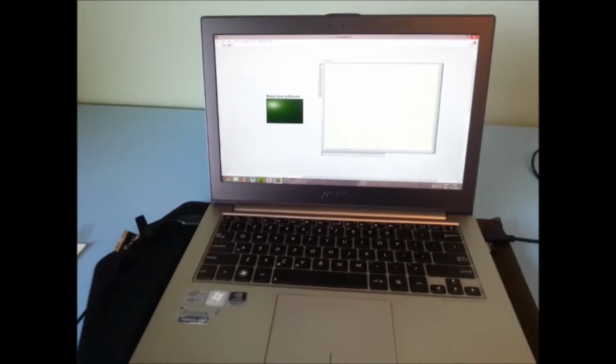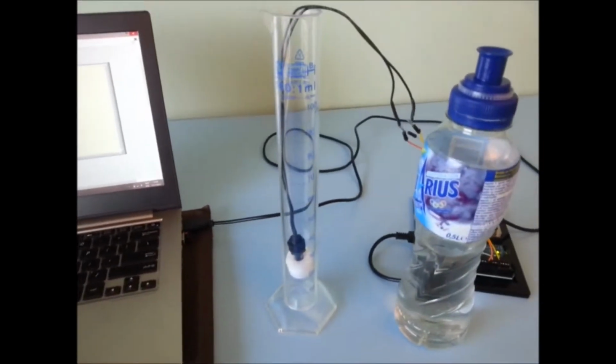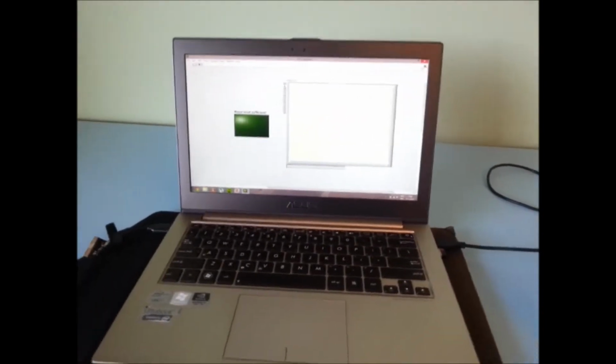But like I said, the strips do need water, so therefore I also integrated a water sensor, which you can see here, and the whole program won't execute unless there's water present. So I'm gonna now give the demonstration.